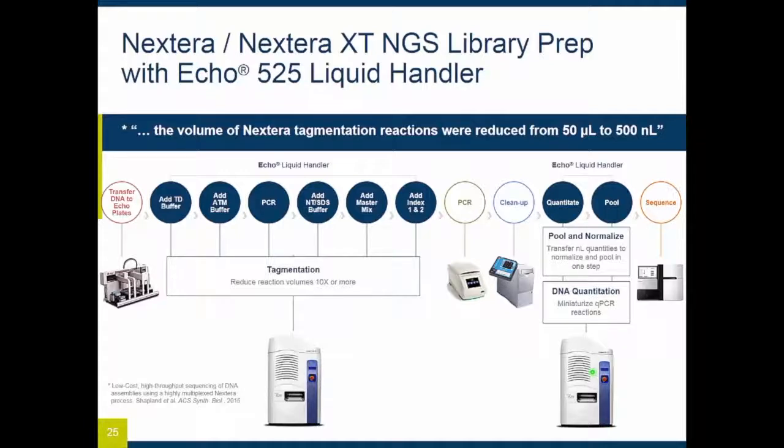Here we provide examples of this miniaturization being employed successfully. First, the Amyris automated strain engineering group published a miniaturized Nextera workflow in ACS Synthetic Biology for plasmid construction. Next, we walk through two of our application notes on miniaturization of Nextera and Nextera XT for human cell, microbial whole genome, and microbiome sequencing.